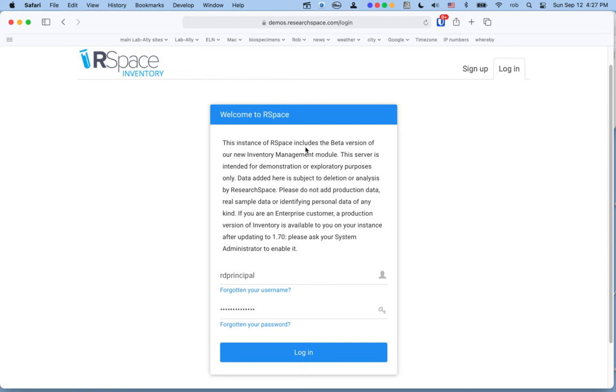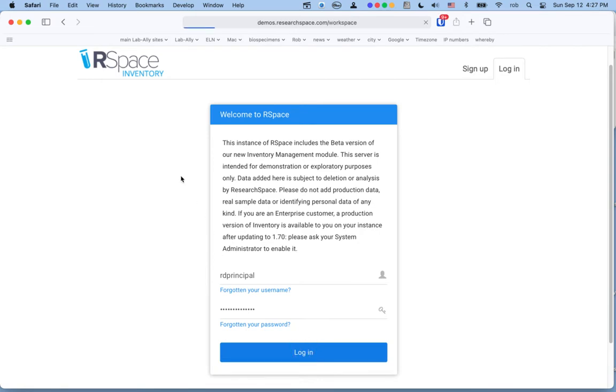This video is intended primarily for people who are new to the RSpace inventory system and who'd like to learn more about the steps you should take when you first get started.